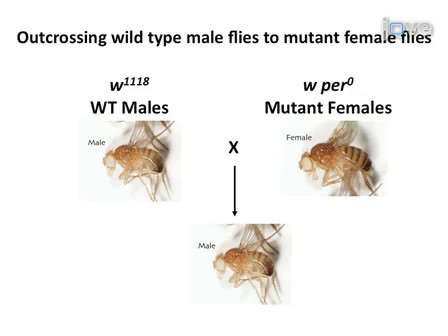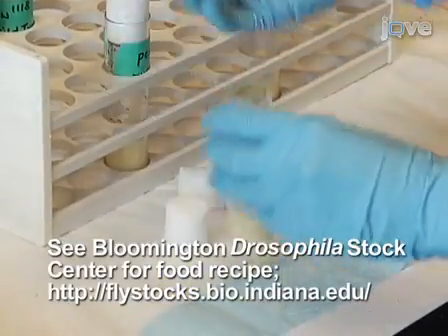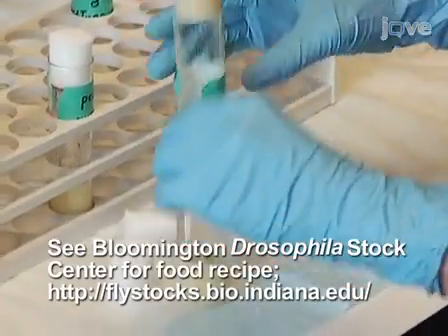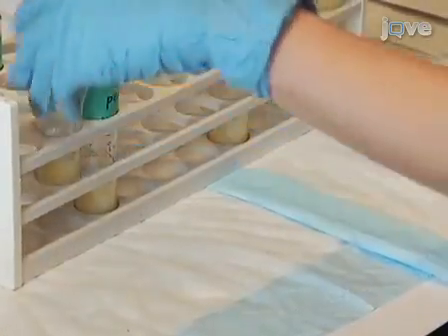When examining circadian and sleep-rest parameters of specific mutant flies of interest, it is prudent to outcross the mutant stock with the wild-type strain of the same genetic background, for example W1118 or YW. Since there is no crossing over in Drosophila males, it is better to perform the outcross by crossing mutant females with wild-type males. Seed both the wild-type control and mutant flies at the same time in standard Drosophila food for about 10 to 14 days before the locomotor activity rhythm experiment.